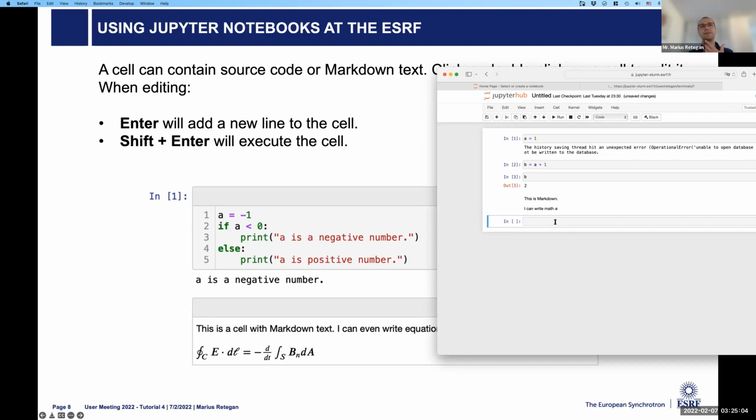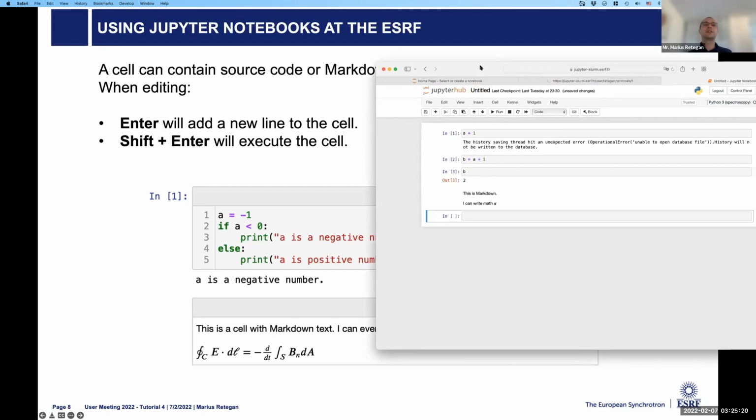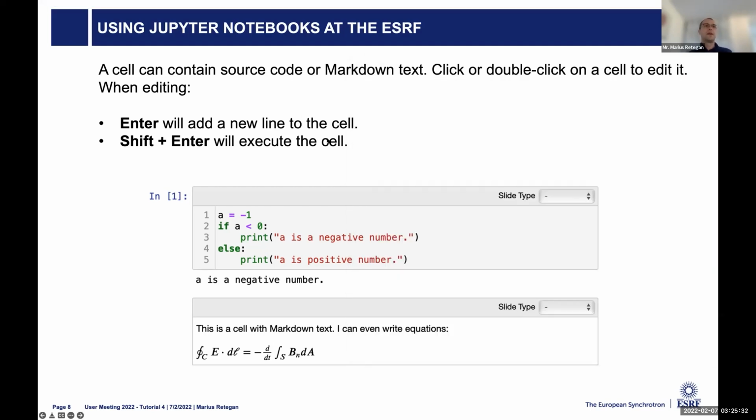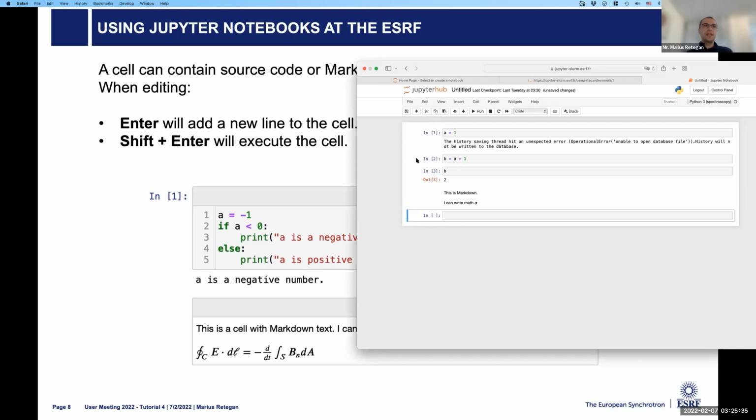I think this Jupyter notebook way of writing code has changed a lot the way people perceive Python, because it's easier to experiment and to write simple snippets of code and just see what the result of that code is. So it's less intimidating. This is what we're going to use all day. I prepared some notebooks for the data analysis part and for the computational part.